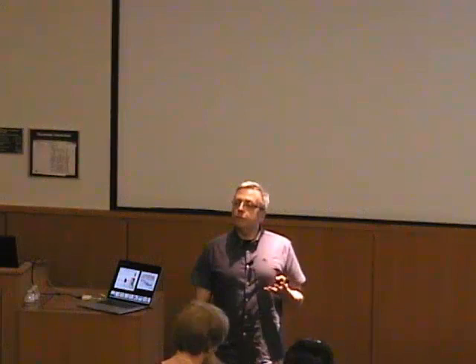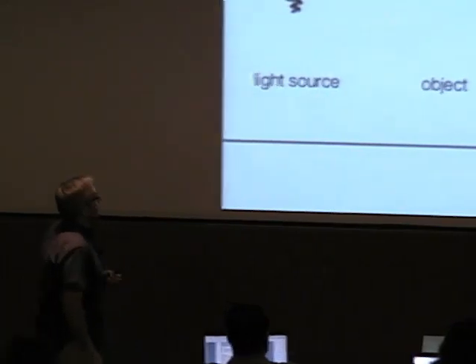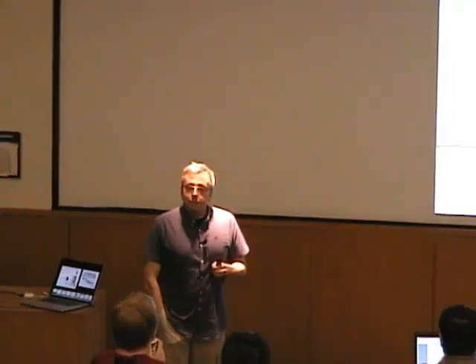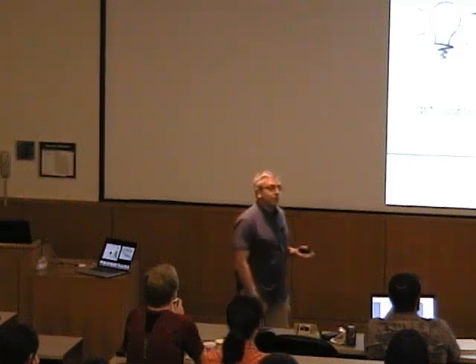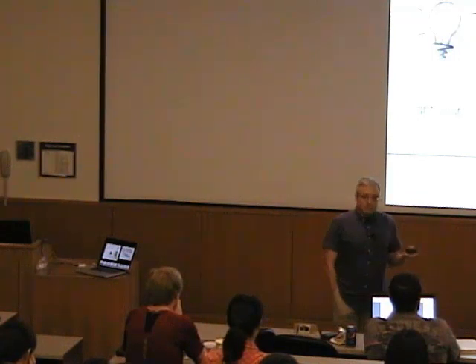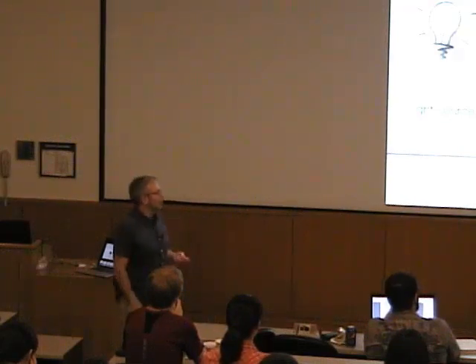That's not very sophisticated, but it's basically a very useful methodology to do as more or less the first experiment that you're doing, because we all agree that knowing the structure of a molecule is not all that you need to know about that molecule. But I would argue that ideally it's the first thing that you know about that molecule before you start doing anything else. That's not only so that you know where the atoms are actually sitting, but it's also because in order to get to the structure of a molecule in the first place, you will need to make sure that you're able to make your sample at reasonable amounts and reasonable purity. That's also an important point for everything else you're doing with it.